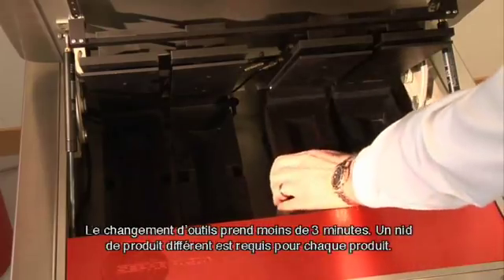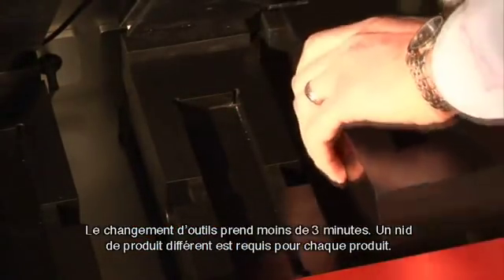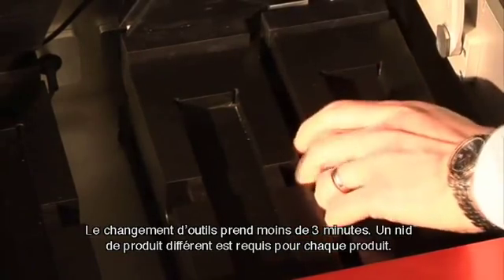Tooling changeover takes under three minutes. A different product nest is required for each product.